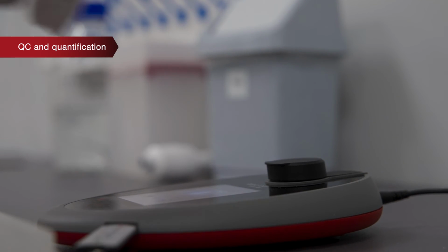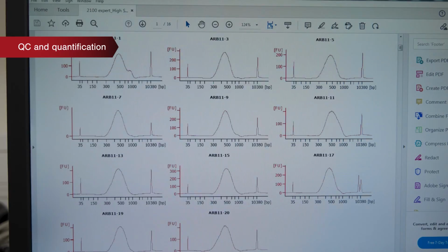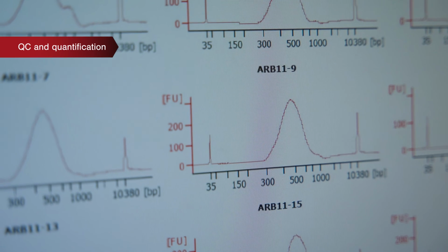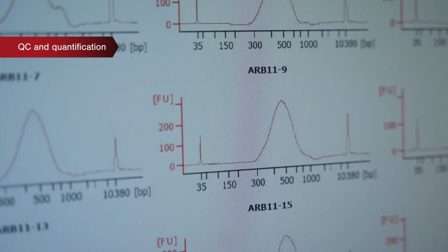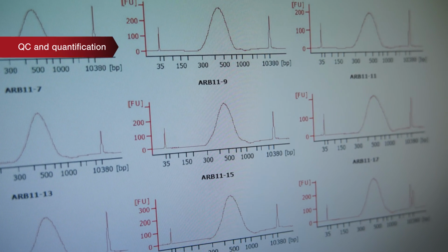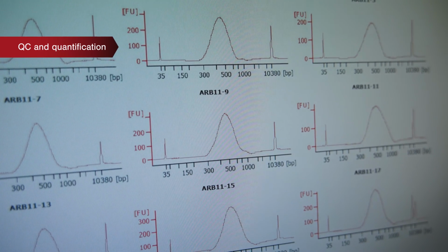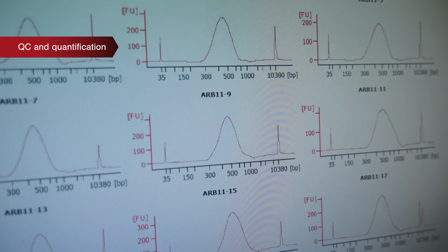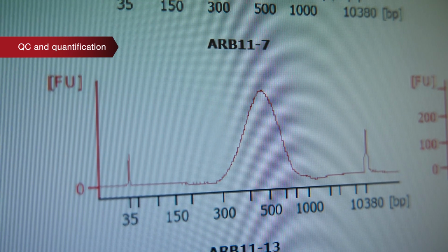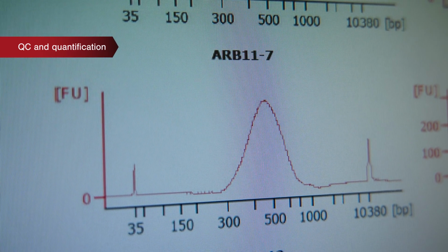In addition, the overall quality of the fragments is visualized with an Agilent Bioanalyzer. The peak should be observed at the target length, which should be around 504 base pairs. The method is based on capillary electrophoresis on a chip. Fluorescent dyes are used which emit a fluorescent signal when binding to DNA or RNA.